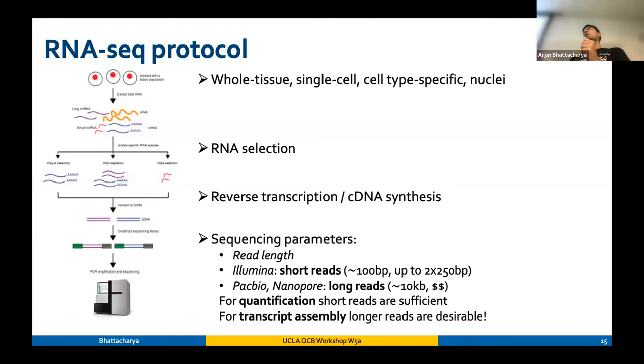If you have longer reads, you tend to run fewer reads per sample. But altogether, the read length times the number of reads gives you the coverage that you have. Coverage meaning, if you line up all of the sequencing reads that you have, how many times you cover the transcriptome.